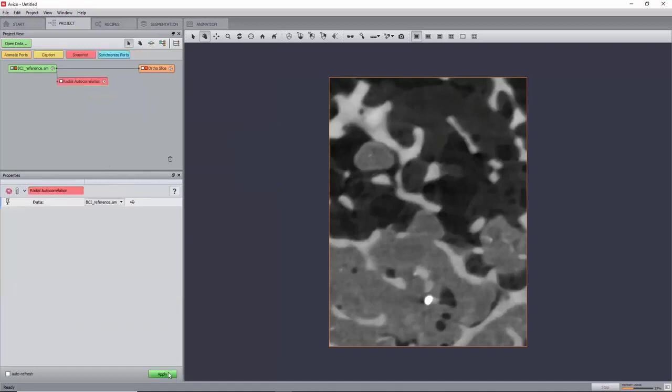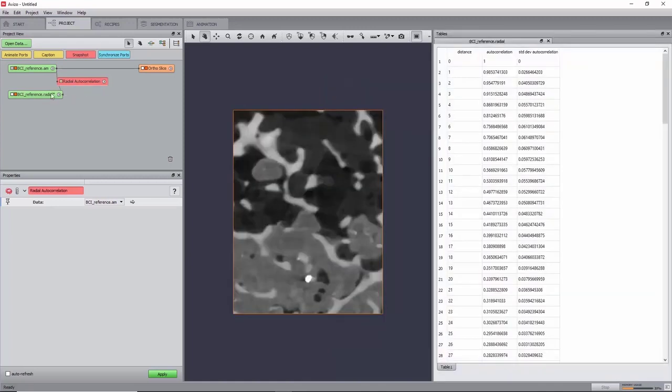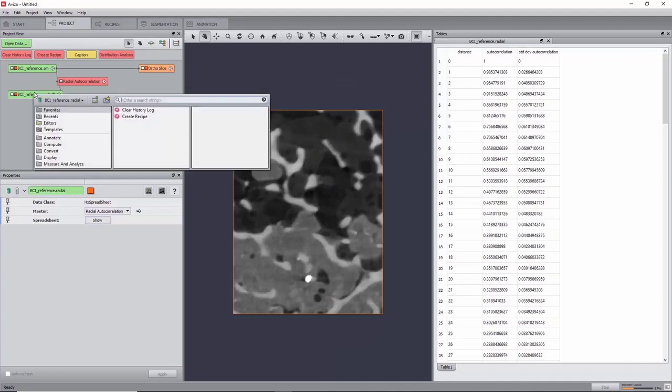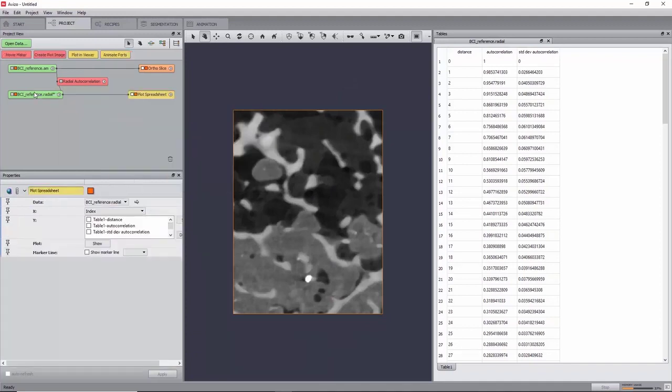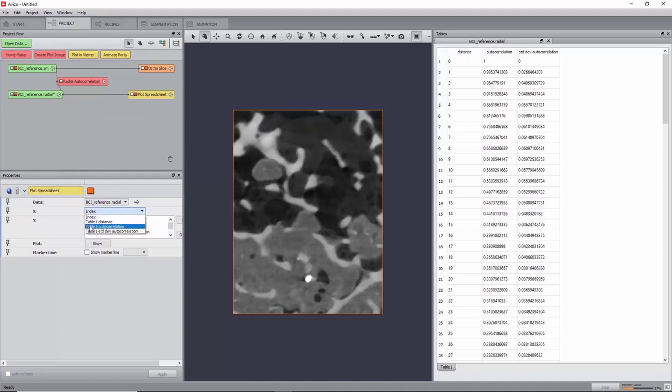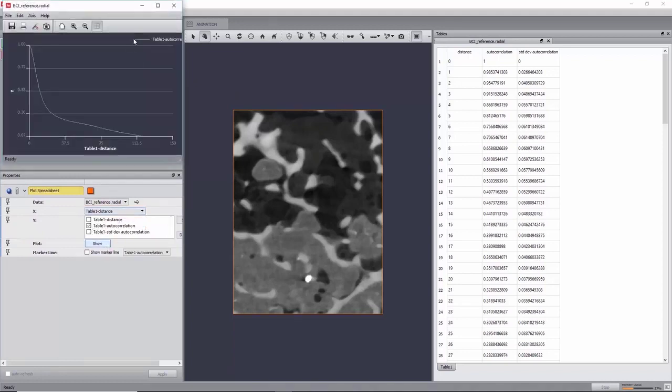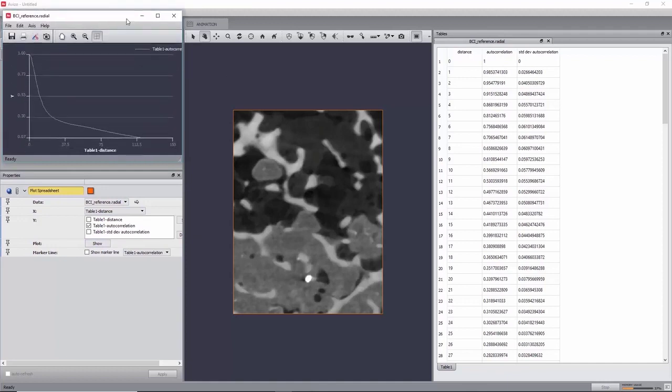This will create a new table with the correlation values as a function of distance. You can plot this by creating a Plot Spreadsheet module, setting Table 1 Distance as X and Table 1 Autocorrelation as Y. Now click Show. A graph will appear in a new window.